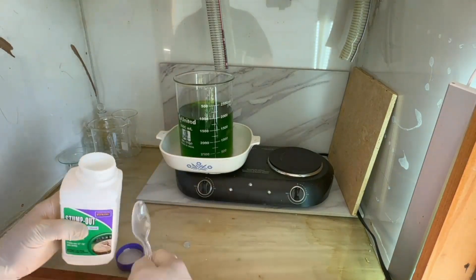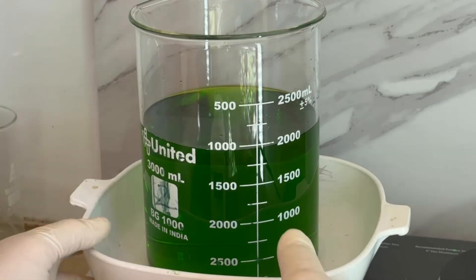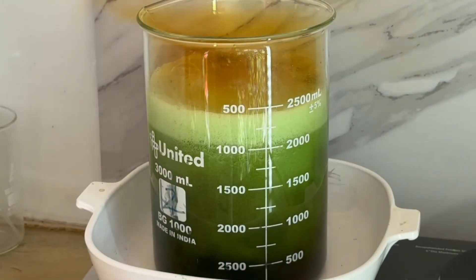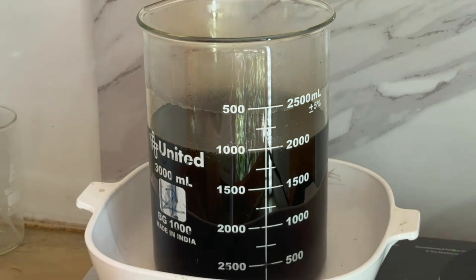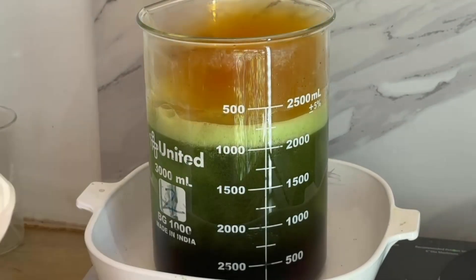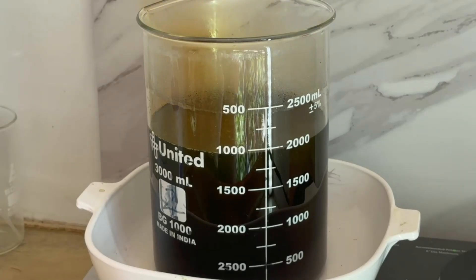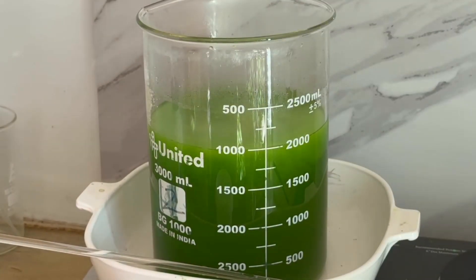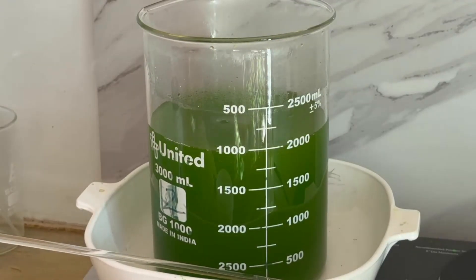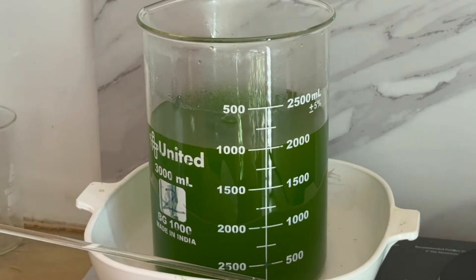We'll add our first teaspoon of SMB — and that was not supposed to happen. Clearly there is some excess nitric in that solution. The SMB will burn some of that up; we'll add a little more to see where we're at. Still way too much. We're going to take a different tack — we'll add some formic acid to eat up the excess nitric and get our solution ready for actually dropping the gold. We'll add this until it stops reacting. It's still reacting, so we'll just keep adding until it stops. That looks good — we'll move forward with the drop.